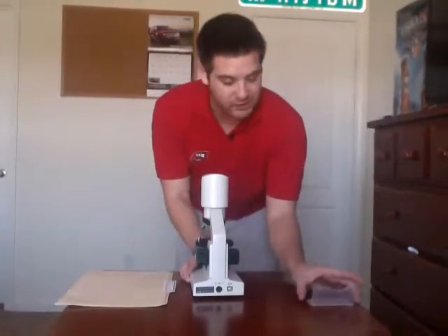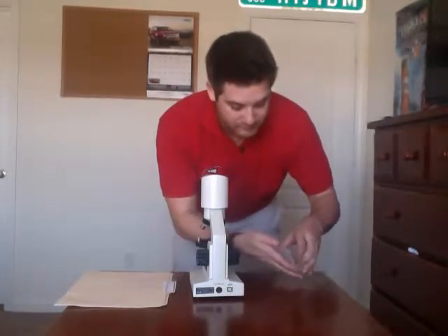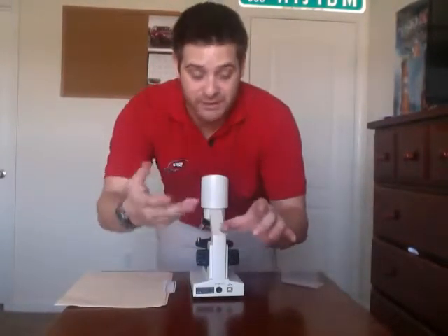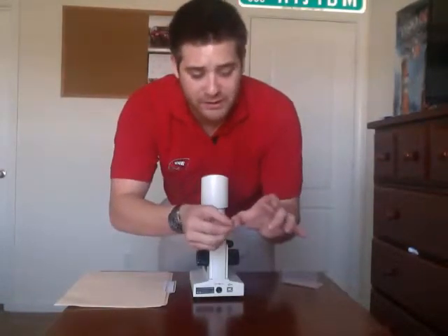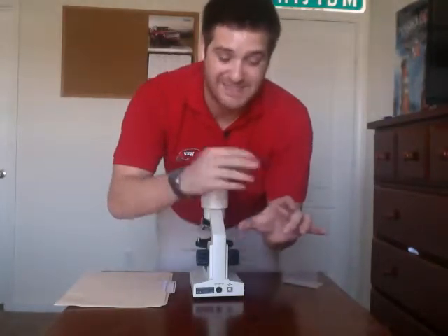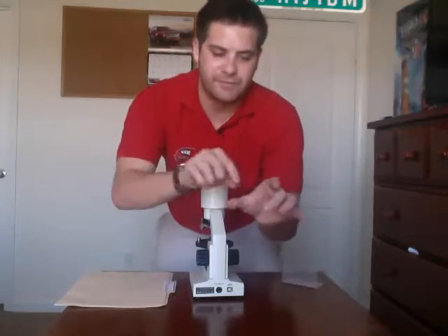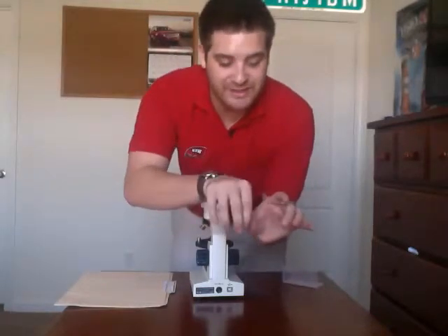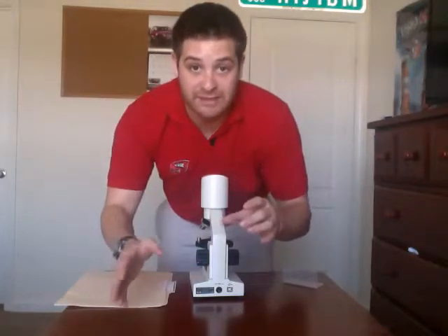Okay, and handling your slides, this is what you would put whatever you're looking at, your specimen, on. Make sure you hold them from the outside. Don't pick it up from the center and get your fingerprints on it, because the oil from your fingers will show up on there and it won't be clear, it'll be all fuzzy. So just be really careful and gentle with these, because they are very fragile. And if you happen to break or drop one, please do not touch it. Raise your hand and a teacher will take care of the broken glass.